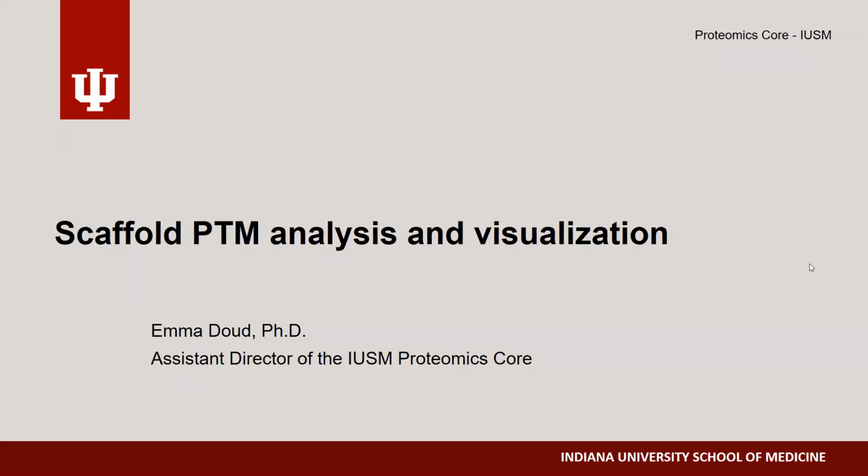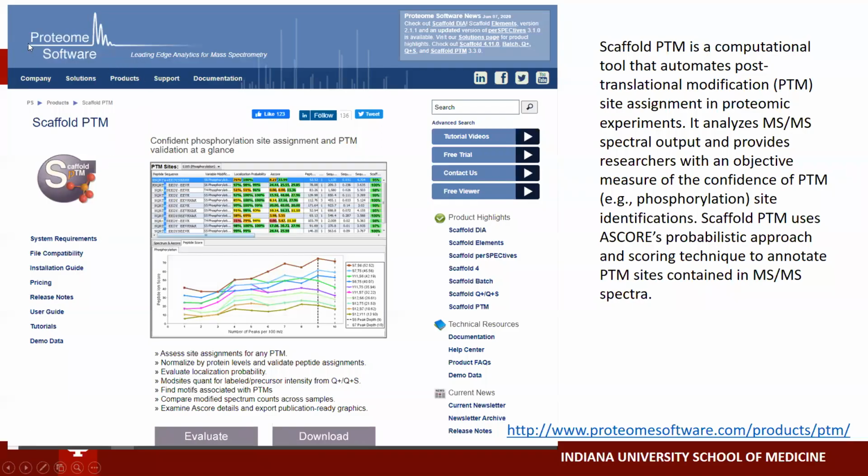I'm the Assistant Director of the IUSM Proteomics Core, and this module of the Bioinformatics course will be covering Scaffold PTM analysis and visualization. So I hope you've already listened to the Scaffold data analysis and visualization. This is kind of a next level sort of data analysis processing program. So again, this is by Proteome Software.